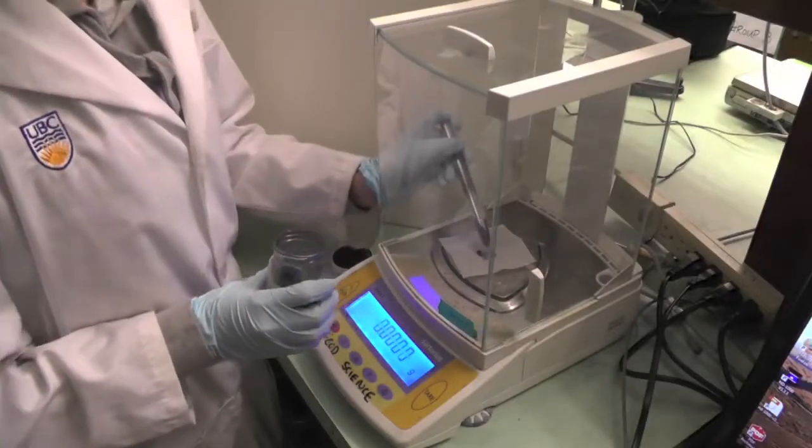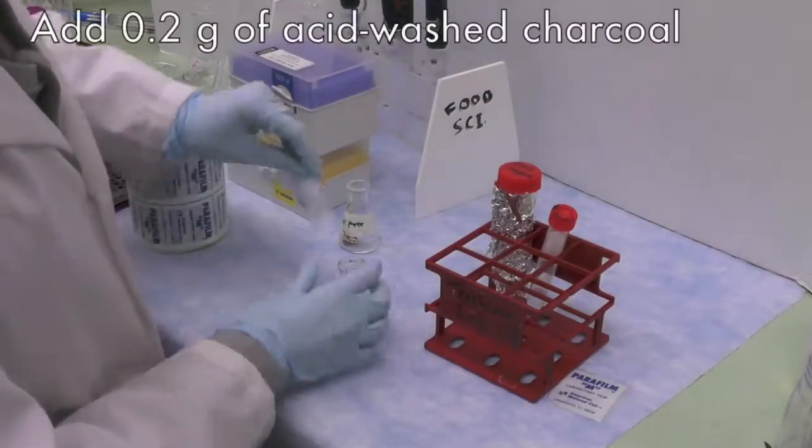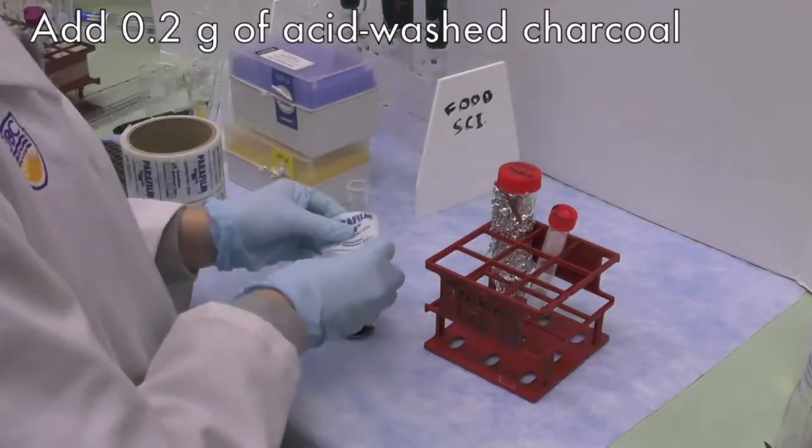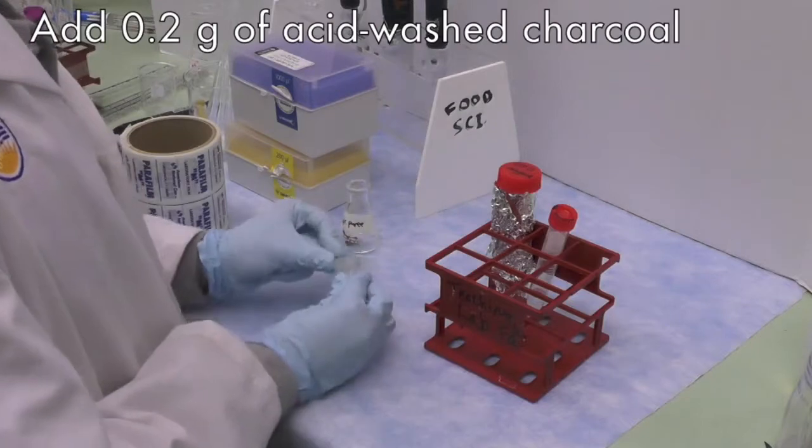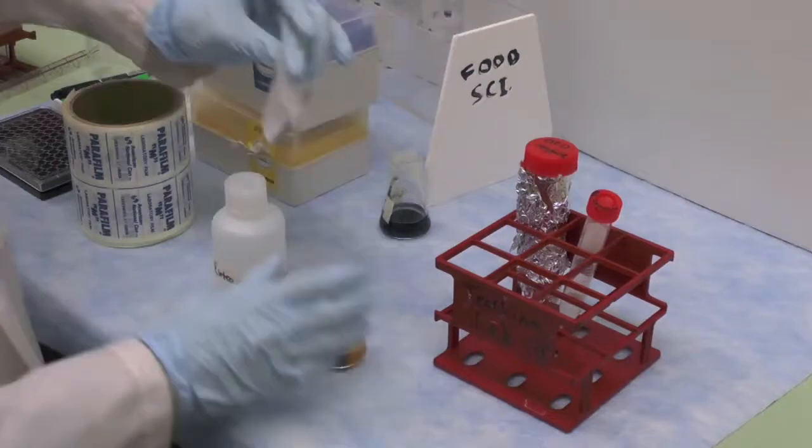Weigh 0.2 gram of acid-washed charcoal on the weighing paper and transfer to the 25 ml Erlenmeyer flask containing apple puree or ascorbic acid. Repeat the procedure for all puree samples, including D-value samples.